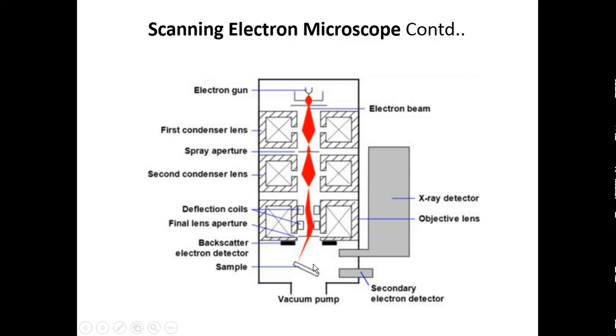And here, when it is reaching the sample surface, of course over the sample surface this high energy beam may create a lot of interactions. Such interactions may be X-ray diffraction, Auger electrons produced, secondary emission electrons, backscattered electrons, and inelastic electron formation. So there are different types of specimen interactions that take place on the surface of the specimen in a scanning electron microscope.